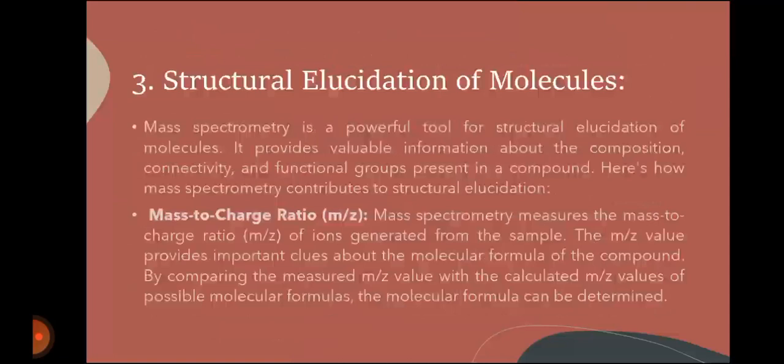Third is structural elucidation of molecules. Mass spectrometry is a powerful tool for structural elucidation of molecules. It provides valuable information about the composition, connectivity, and functional groups present in a compound. Here's how mass spectrometry contributes to structural elucidation.